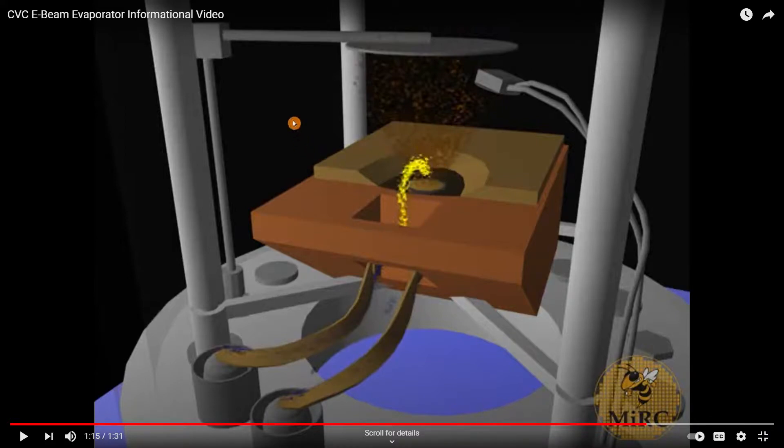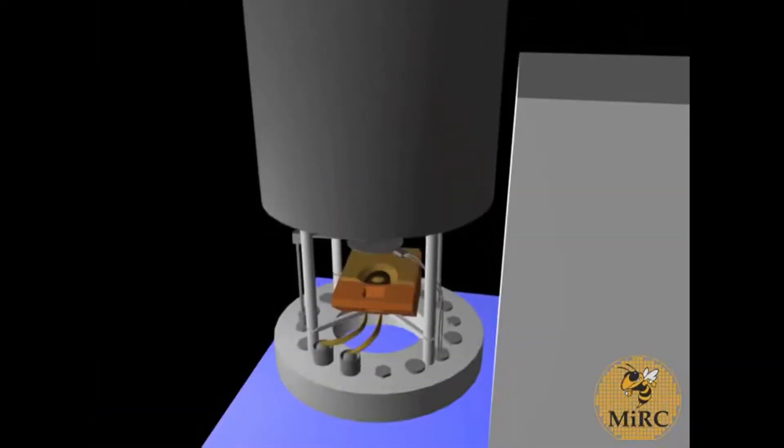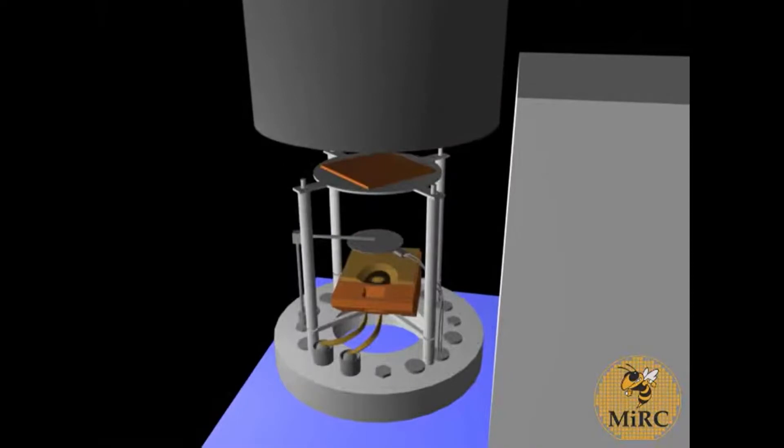After you cool down, you open the chamber and take the substrate out. You've finished the evaporating process. The shutter is closed, and the pressure inside the chamber is then increased to atmospheric pressure before the chamber is opened.